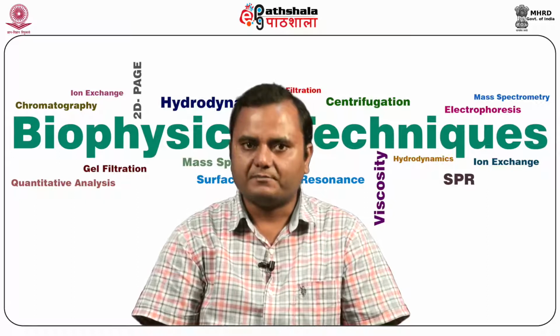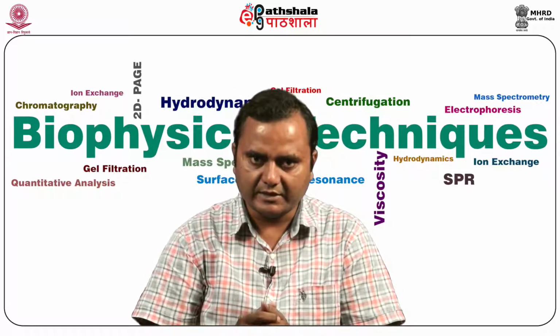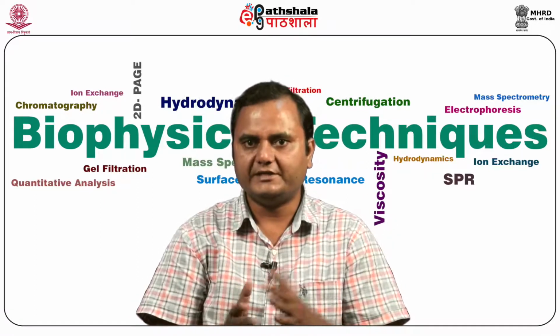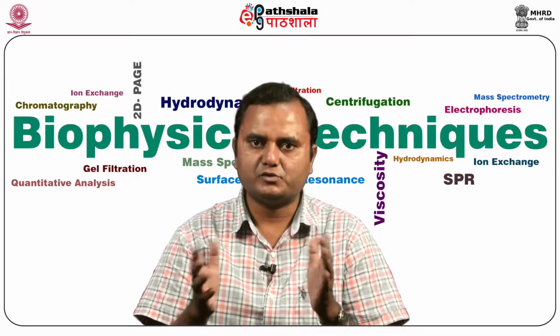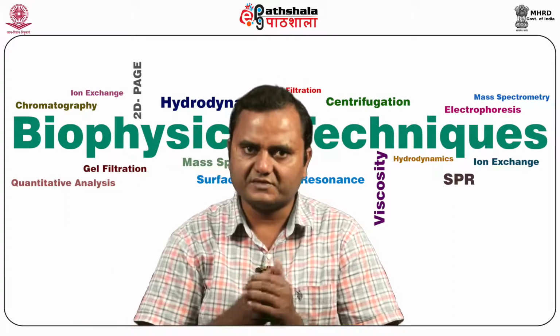It is used for biological studies to sediment and separate out the components, and this centrifuge is equipped with a detector system which is used to monitor the sample as the sedimentation occurs during the course of centrifugation.